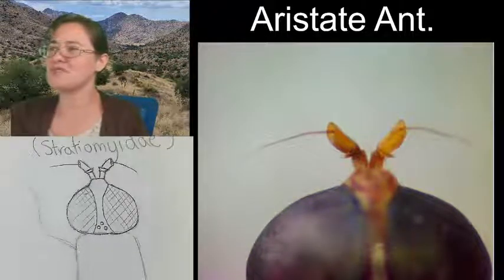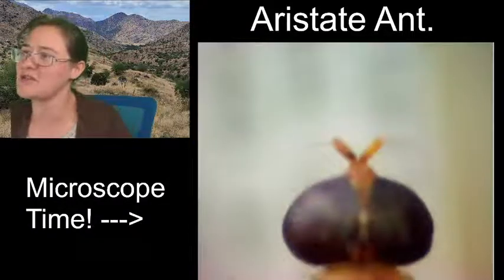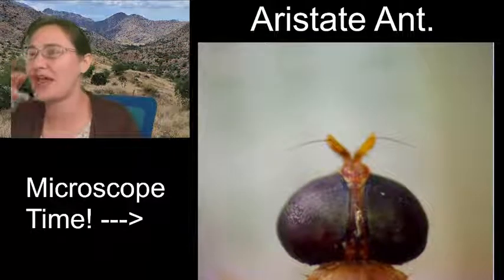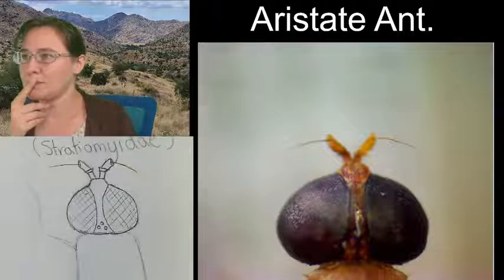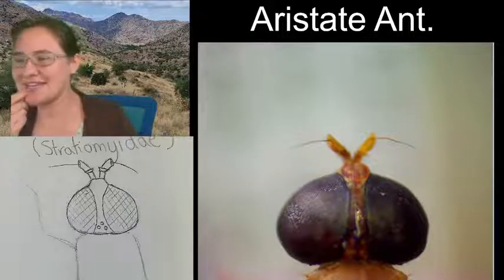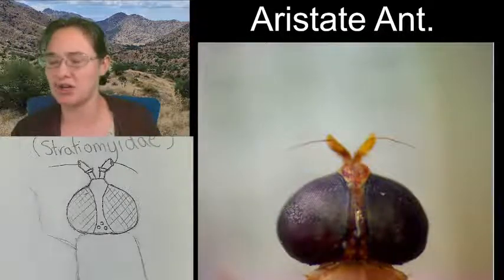Maybe when I zoomed into the antenna, I made my aristate antenna a little bit long. So I'm going to zoom out to see the size of the antenna versus the rest of the head. Nope, that's about right. Maybe the head should be a little bit wider even.